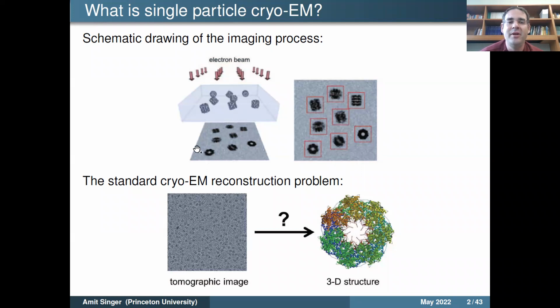And then what you obtain are, by the way, can you see the virtual hand when I'm moving it? Yes. Okay, great. So what you obtain are tomographic projection images called micrographs, and those micrographs contain projections of individual particles, of individual molecules.